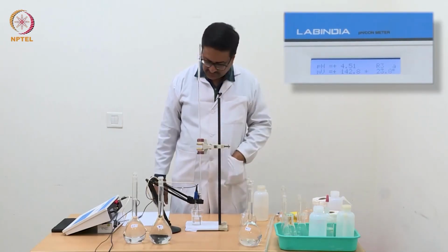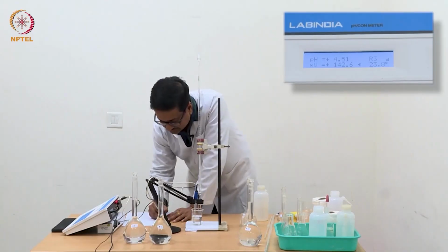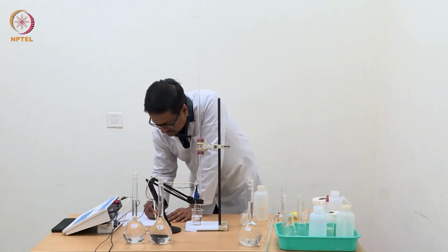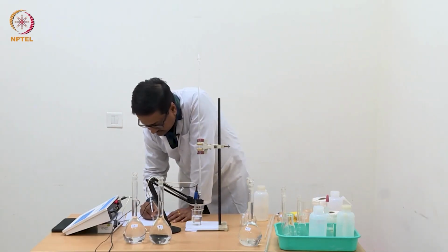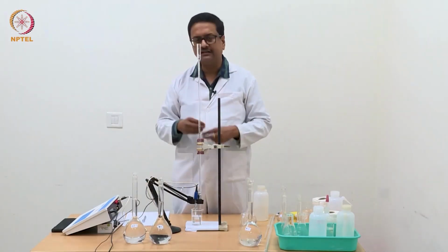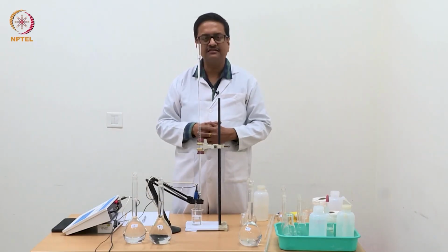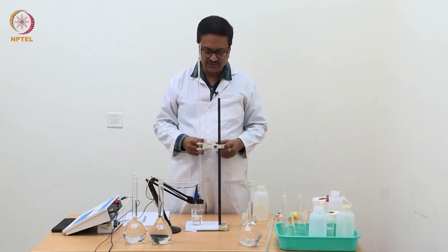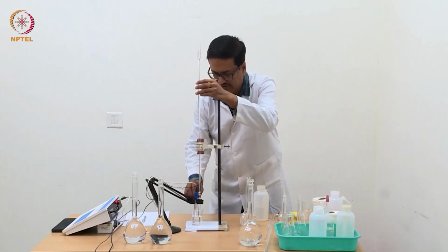So now I have reached a point where I have added up to 0.5 ml of NaOH and the current pH is 4.51. I am always doing these measurements after every 0.02 ml of NaOH addition. So when I discuss the results, I will show you the readings and then show you how to plot this data.